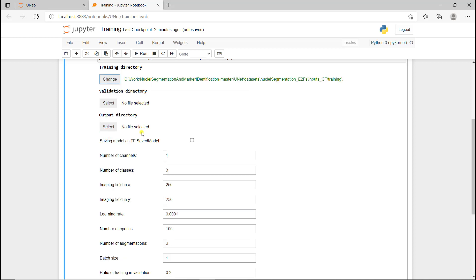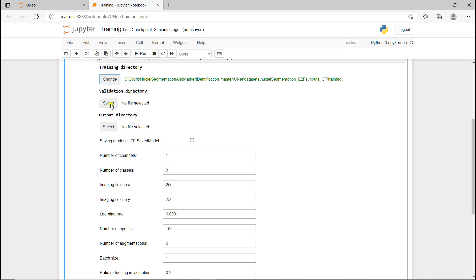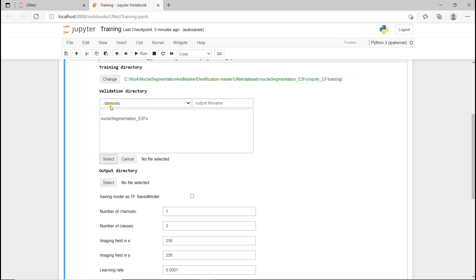Then you can either select the validation directory, which we're going to do, but if you don't, you have this final parameter here, ratio of training and validation, that can be used. Here it's defined at 0.2, so 20 percent. It could be less or more, but if you don't have a validation directory and you keep this parameter at 0.2, the algorithm is going to randomly pick 20 percent of your training data as validation. But here we have a validation directory, so I'm going to click on select and choose the validation folder. It's organized the same way: images and masks.